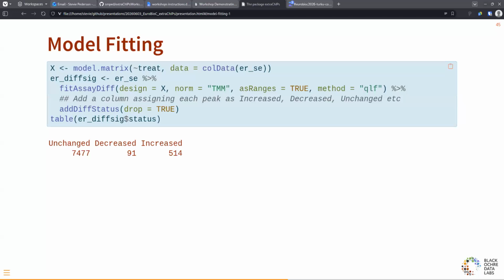Yeah, so quantile normalization was a big thing in microarrays, and it was really helpful, I think, in that context where you have, I think it was 11 probes to a probe set, and you quantile normalize your probes and then merge to a probe set, so you didn't get any over normalization artifacts because it kind of averaged itself out a little bit in that probe set merging thing. And so sliding windows are analogous to me in ChIP-Seq. That's just my opinion.